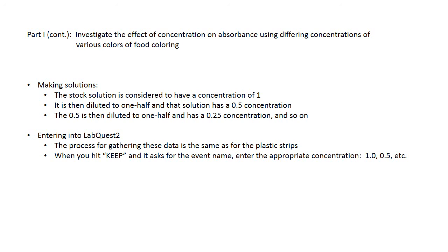When we do that, we have some stock solutions made of food coloring. And the first one we're going to call concentration of 1. It's not really one anything, it's just our most concentrated one we're going to work with. The idea is we'll make half dilutions of that, which is pretty straightforward to do. If I take one of those cuvettes and count how many drops I can put in there, take an even number, like 40 or whatever it is, just put them in there until it's about 2/3 full. Count those drops, that's how many drops you can put in.